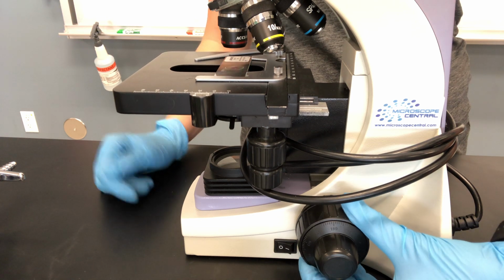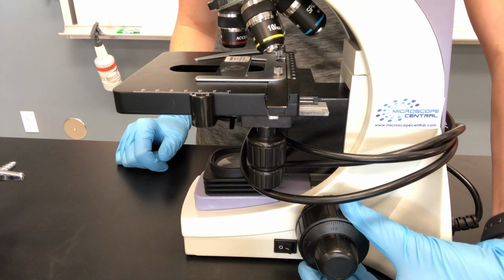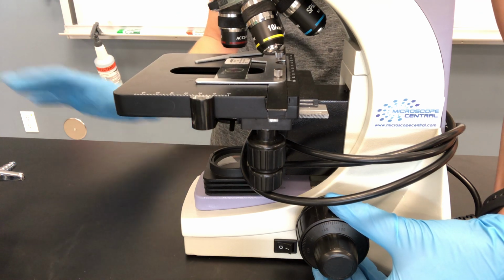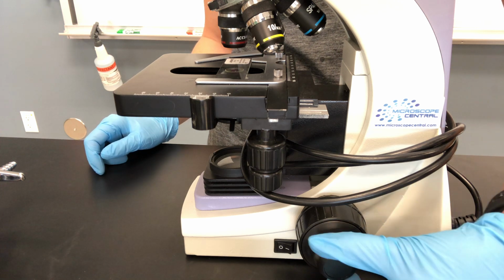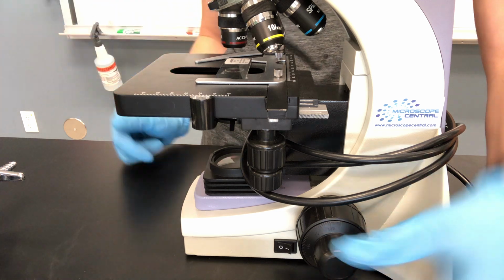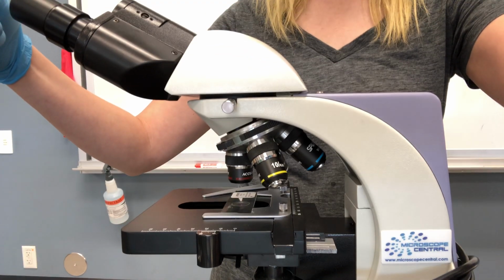Most things are pink or purple, so it's going to look kind of fuzzy, and then you're going to lower the stage until it comes into clear view. And then you're like, oh, okay, I can see it. So then you move to the fine focus to get that nice and clear. And all the while you're looking in these eyepieces up here, okay?